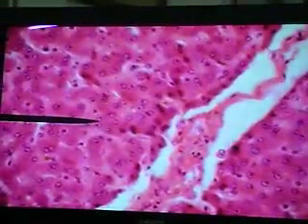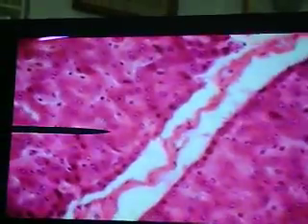Now very interesting is to note, these are special cells. These perimeter cells here, these are special cells. Okay, notice that. These are right at the periphery of the lobule. So these are now cells that are going to be exposed first. But there's a lovely portal triad here for you, and there should also be some autonomic nerves. This portal triad, there are autonomic nerves, vagal fibers coming into the liver. Right, so it has an autonomic innervation.